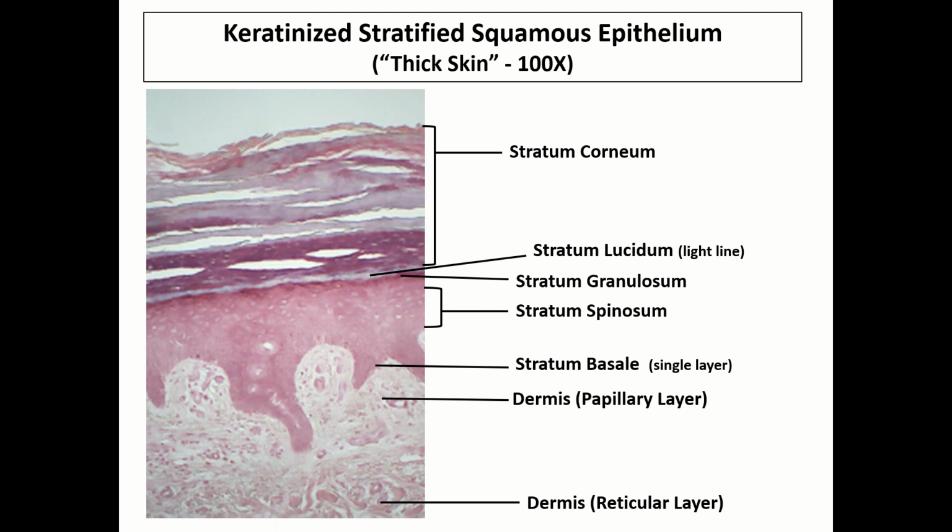Areolar connective tissue can also be found when you go back and look at your skin slides. You'll recall that the epidermis here was made of epithelium, and just below it you had a papillary layer of the dermis. And this papillary layer is made of areolar connective tissue.